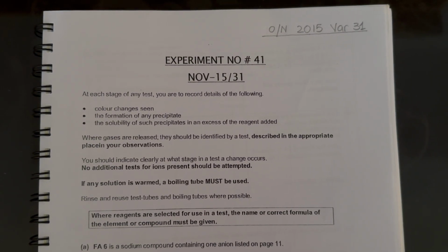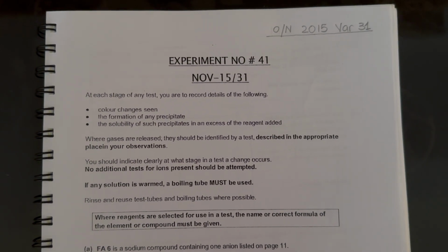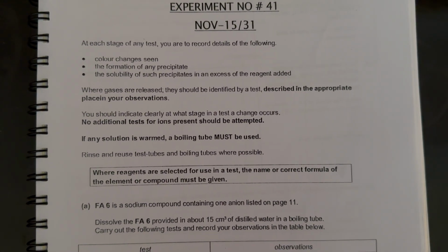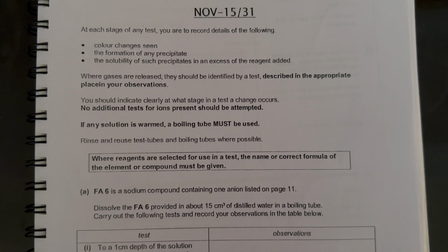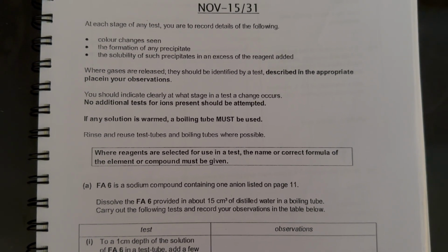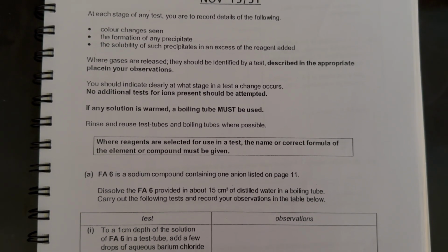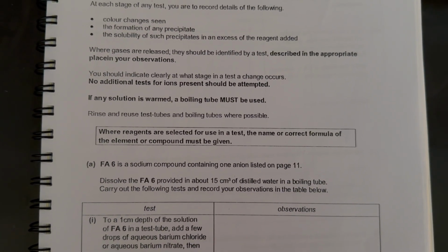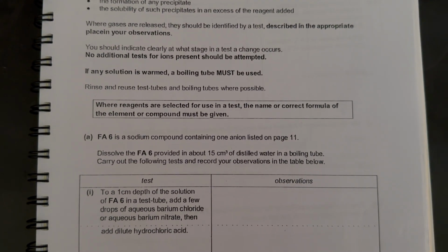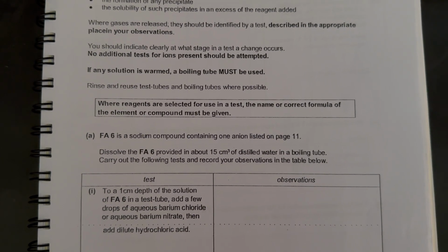Qualitative Analysis from October-November 2015, variant 3.1. In this question, they have said, at every stage of any test, you are to record the details of the following: any color change seen, formation of any precipitates, solubility of such precipitates in excess of reagent added, and where gases are released, they should be identified by a test described in the appropriate place in your observation. Then you are to indicate clearly at what stage in a test a change occurs.